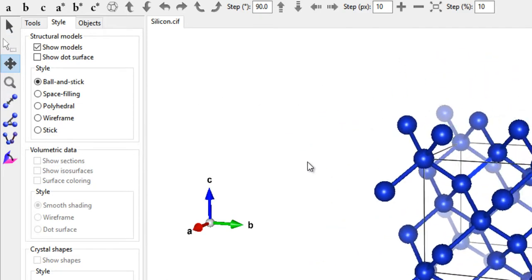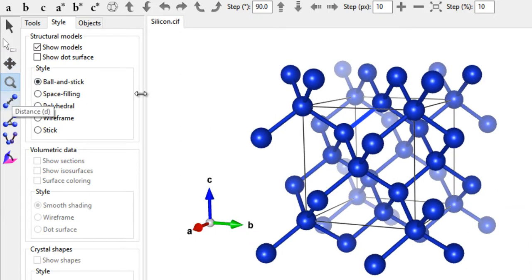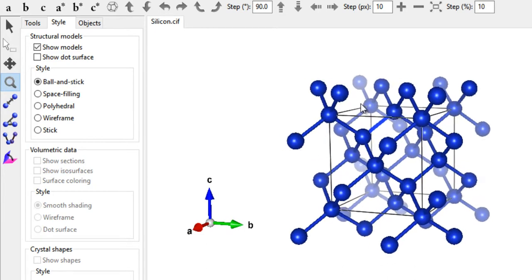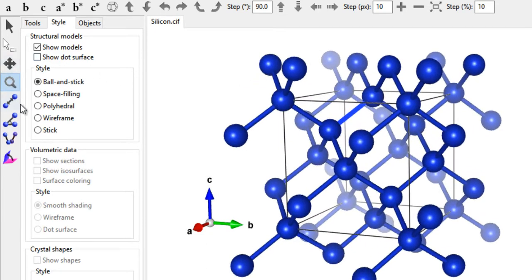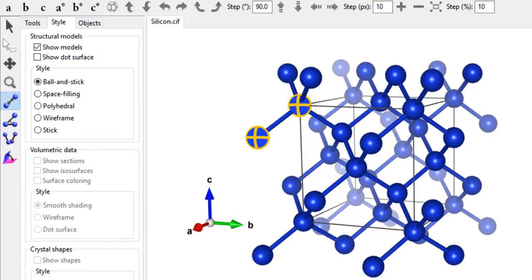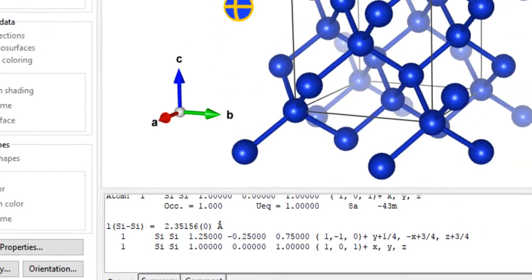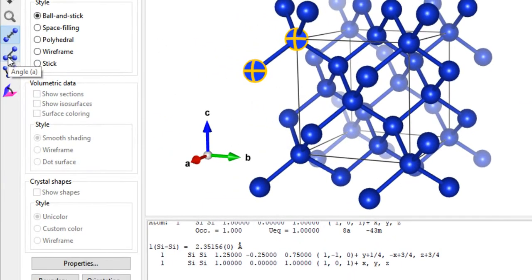You have a translate mode where you can pick up the crystal and place it anywhere on screen. There's also a magnifier tool to zoom into your crystal. Then there's the bond distance measurement tool — click on two atoms and you get the bond distance between them. For silicon, this gives 2.3515 Å, along with the positions of the two atoms.